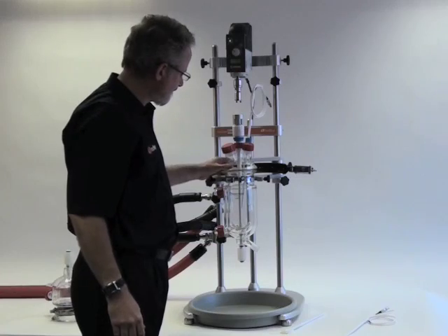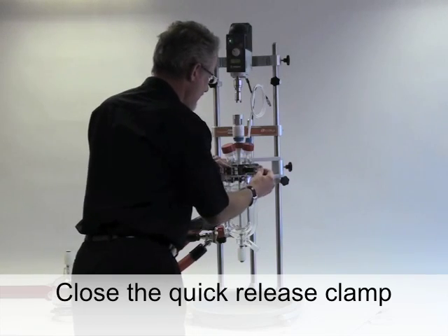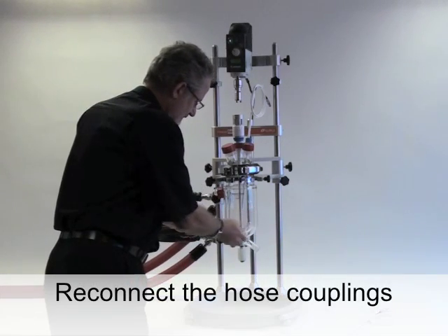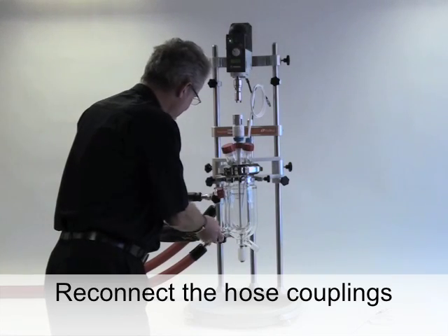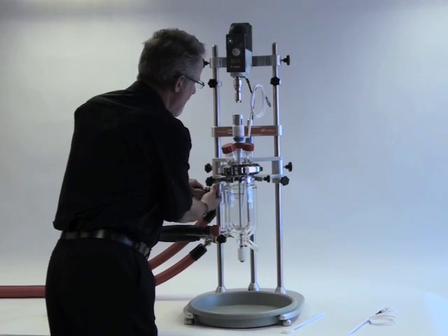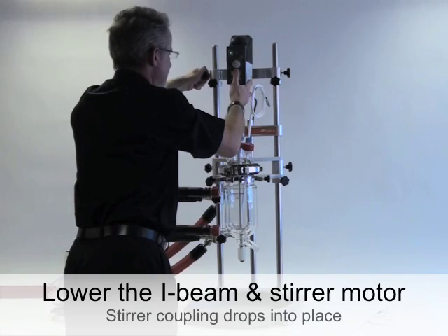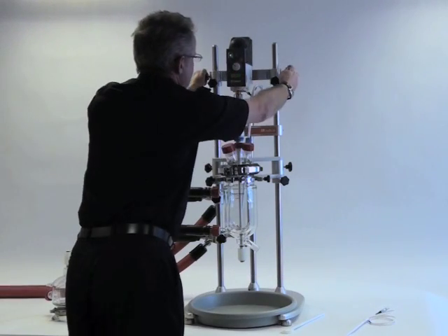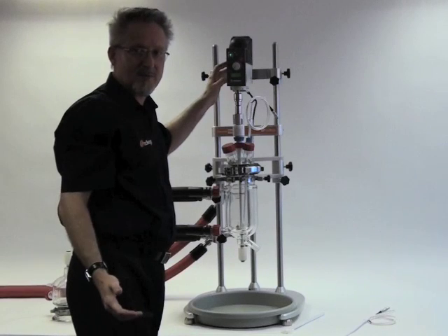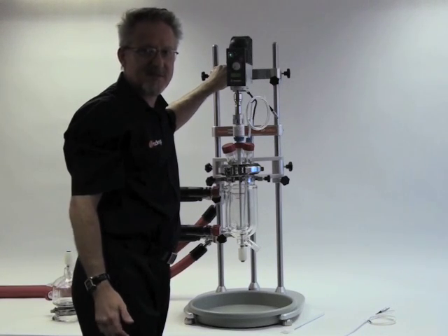The PTFE collar holds the lid in place. Redo the quick release clamp, reconnect the quick connect couplings, and return the overhead stirrer to the correct position. This is a Heidolf overhead stirrer which we'd normally recommend, but in fact the stirrer support beam can accept other brands with support arms of up to 16.5mm in diameter.